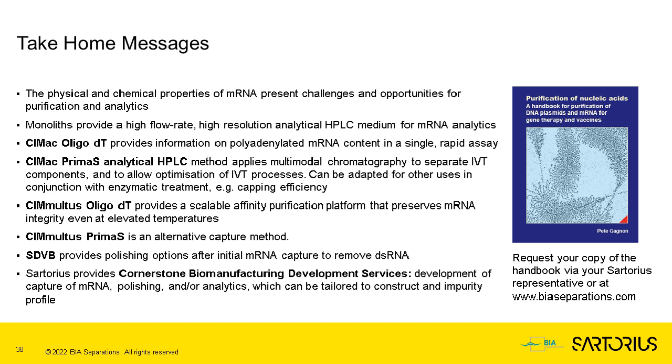We see a whole range of RNAs being used using this analytical approach, 1,000, 4,000, 6,000, 8,000. I hear reports of larger even than that being used around the world. So theoretically, there is no limit to the size of RNA that can be used with this approach.